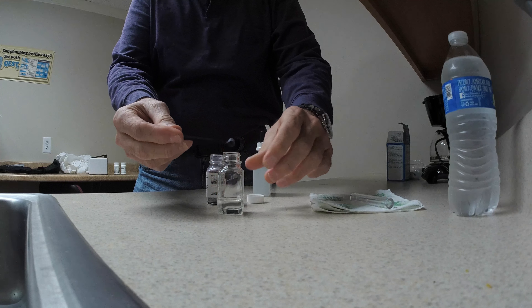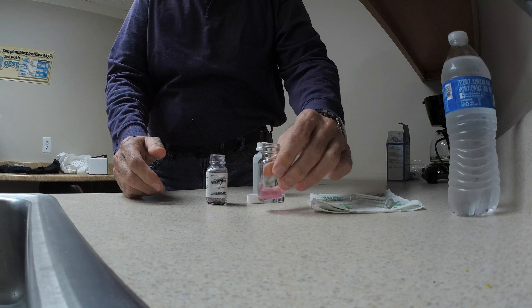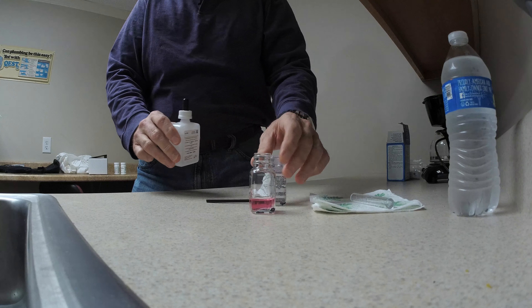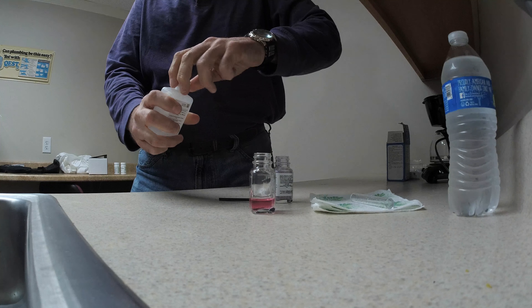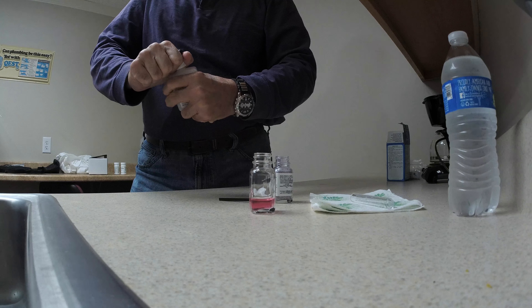So we get our spoonful, put it in, and we just give it a little swirl — and you can see how pink the water is. So what we're going to do now is use this titrate, and for every drop we put into the water we want it to turn blue. Once it turns blue, each drop will tell us how many grains per gallon of hardness the water is.